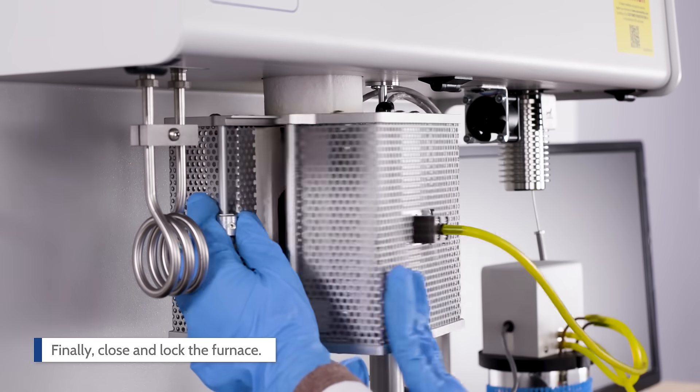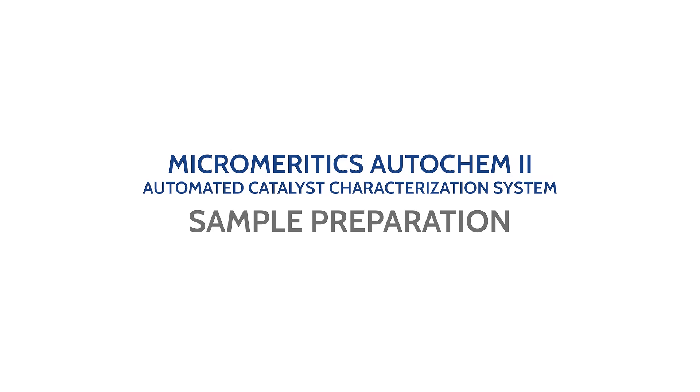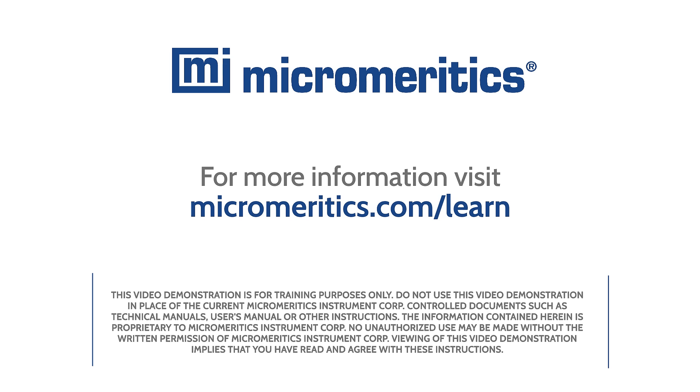Finally, close and lock the furnace. Now the sample is ready for analysis. And that completes this demonstration on how to prepare a sample on the Micromeritics AutoChem II Automated Catalyst Characterization System. For more information, visit micromeritics.com/learn.